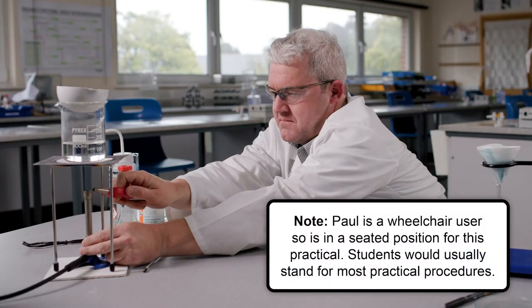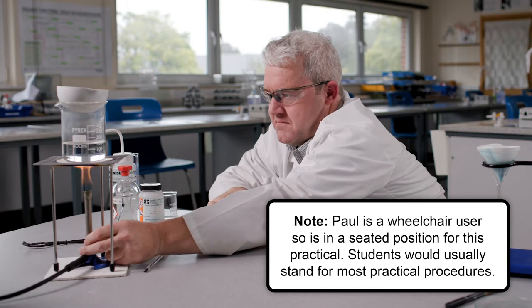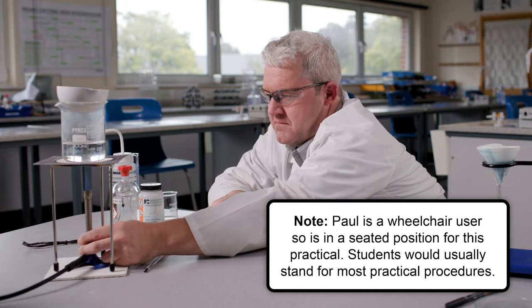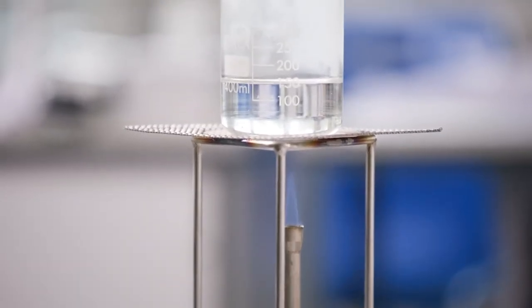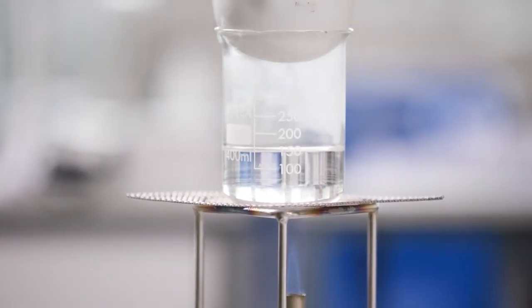This experiment also involves heating with a Bunsen burner. Extra precautions must be adhered to: tying hair back, making sure there are no loose articles of clothing or any other flammable materials nearby.